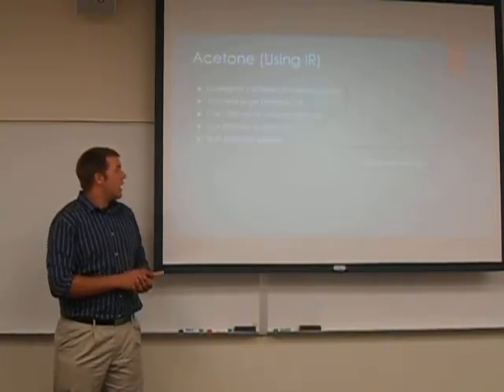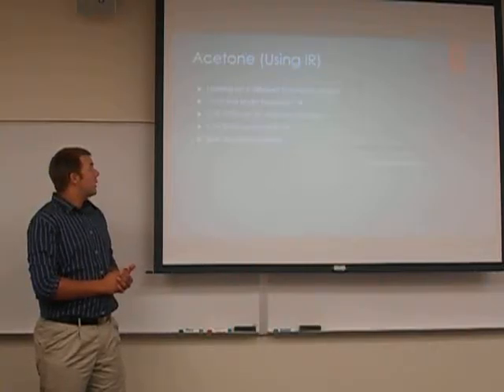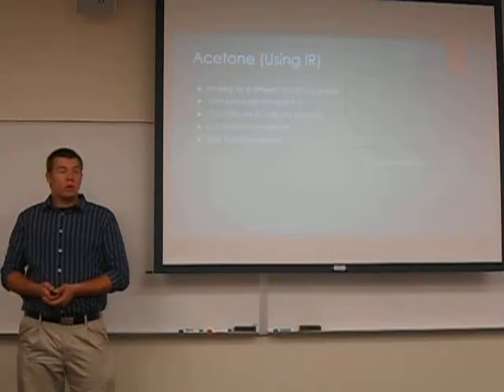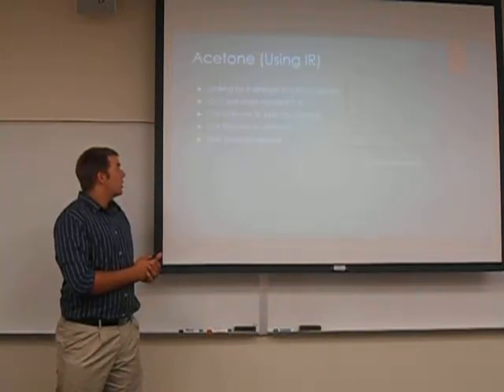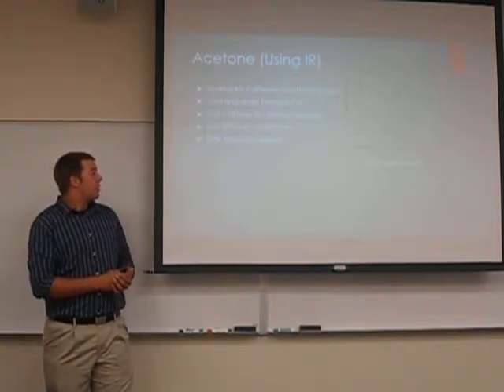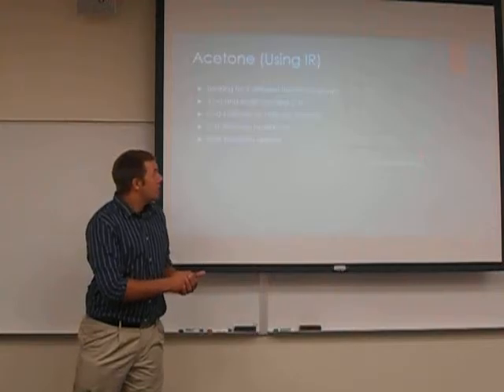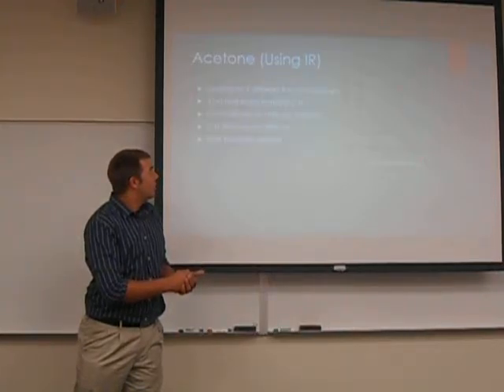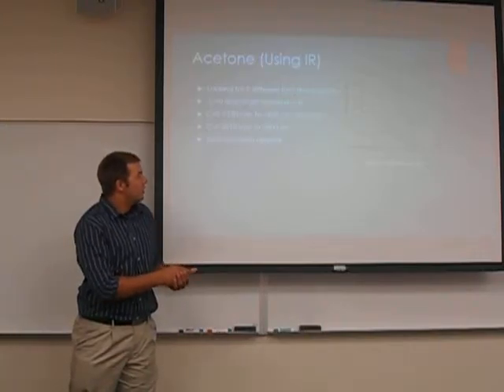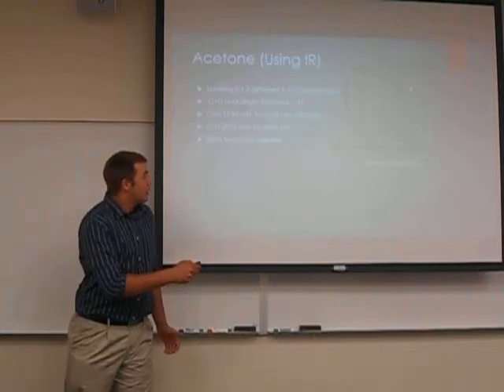Now we're actually looking at the IR spectrum. Again, we want to see the C double bonded to O and the C singly bonded to H. Those two are going to appear within 1750 to 1650 and 3010 to 2800. You can see here, this is the first one. This is going to be the C singly bonded to H, C single bonded to H down here, and the C double bond to O right here, this arrow is pointing.